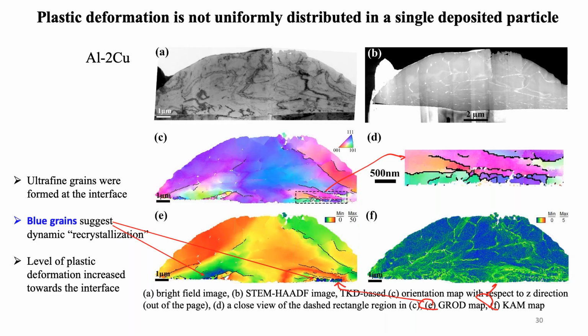One of the things we noticed is that we actually had the formation of ultrafine grains right at that aluminum steel interface. As we would predict, and as we kind of saw in the SEM in the deposit, this is where these things come from. They come right at that impact site. They do have low values of intragranular misorientation. I think a lot of times we like to call that recrystallization. I'm going to use quotes on that, and we'll talk more about why in a few minutes.